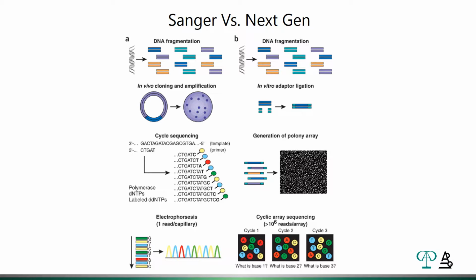However, the molecule that is most abundant in the mixture that you made during your polymerase chain reaction is the molecule that you'll be sequencing, and therefore the sensitivity of that platform is somewhat limited. And indeed, anything that is present at less than 20% of the amplicons that you make is not reliably detectable through Sanger sequencing.